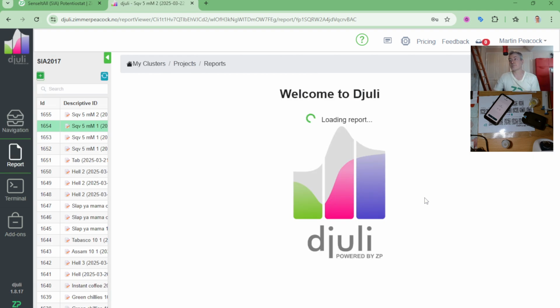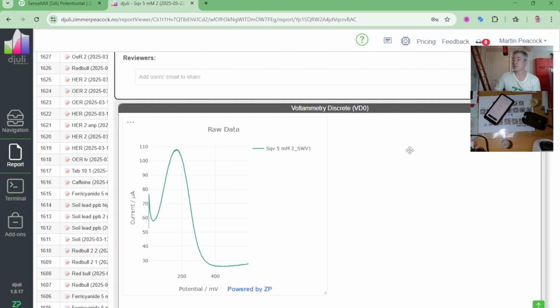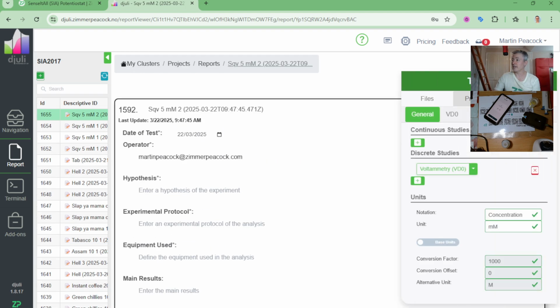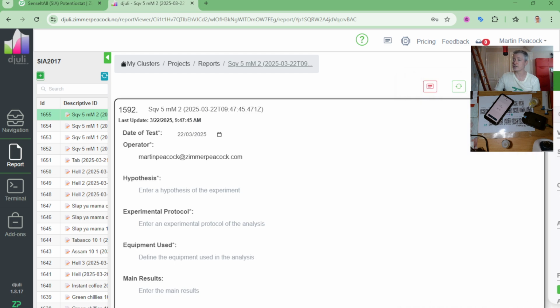And then there's a very powerful set of tools for interpreting the data. So here's my signal. This is what I saw appearing on my phone in real time. But I can go into here, and what I'm looking at here is actually the difference. I haven't explained square wave voltammetry, but there are two almost signals behind square wave voltammetry.